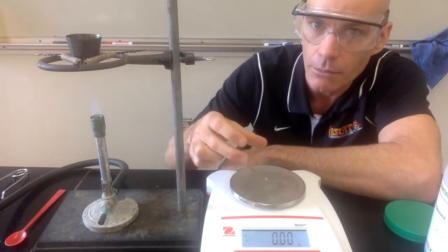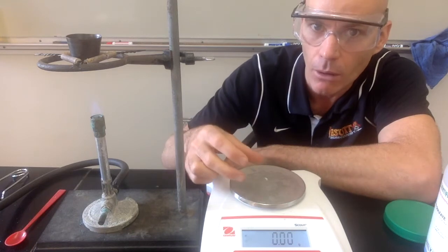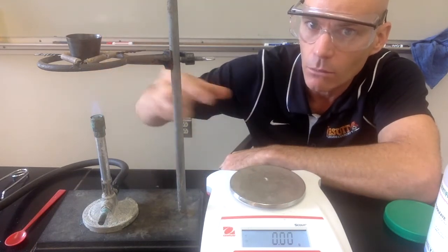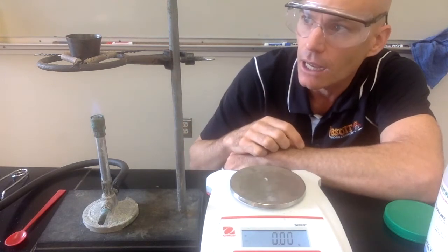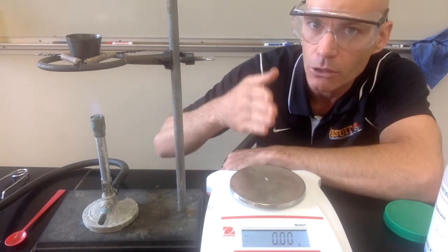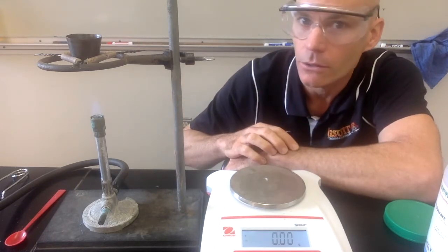At the beginning, it was copper sulfate and water. We're going to evaporate out all the water so it's just copper sulfate. We'll weigh it again at the end and figure out how much water evaporated, then we can determine the ratio between copper sulfate and water molecules.